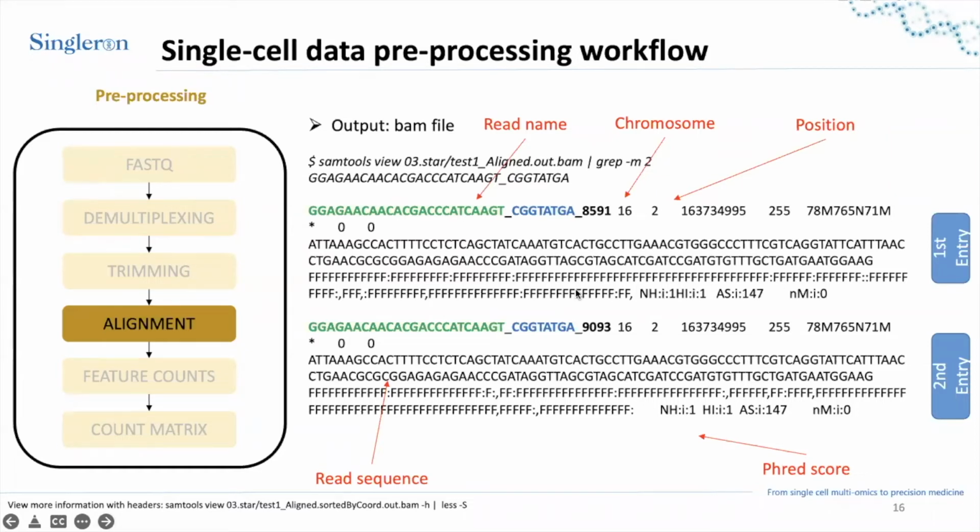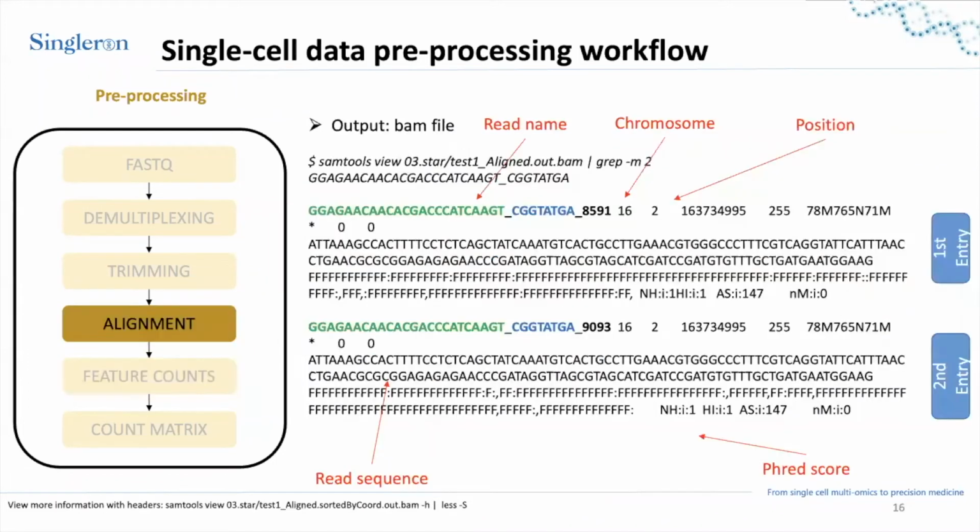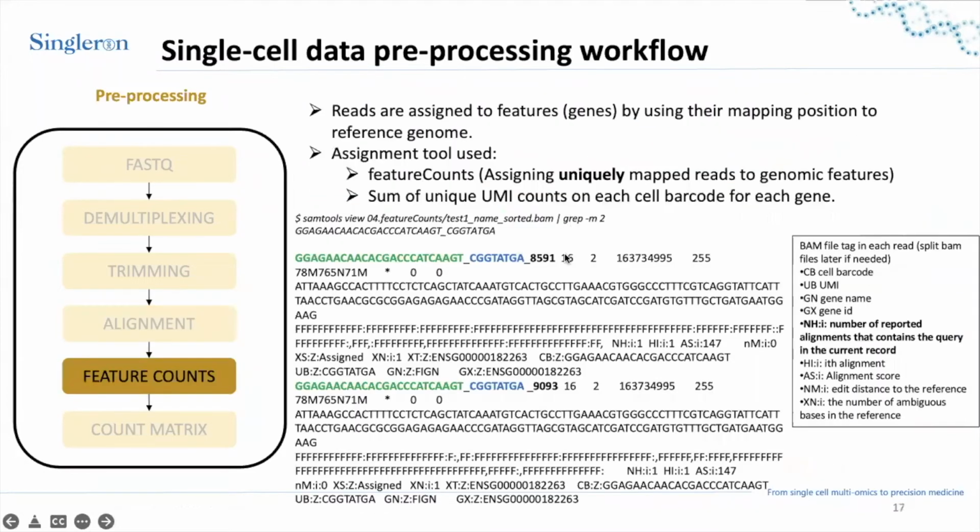Which we will see on the next slide. So from the alignment, and from the genomic locations where this read managed to map, we can now go back to the genomic locations of the genes. So now, after the alignment, we can start to count the features.